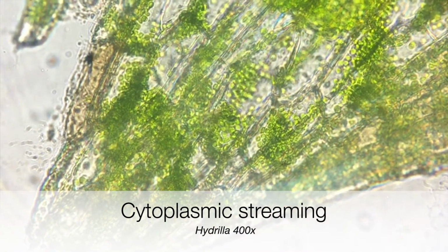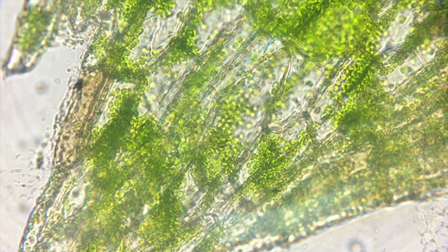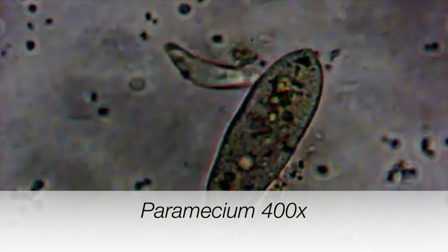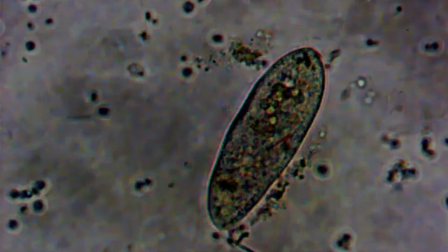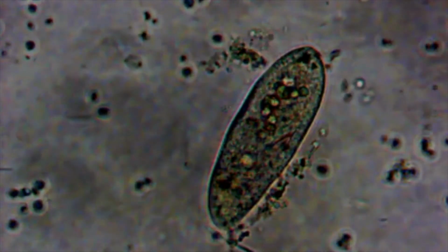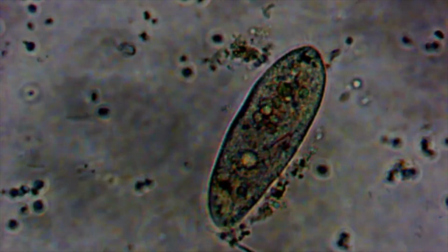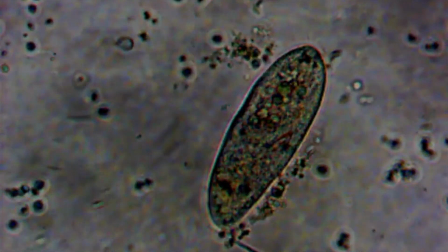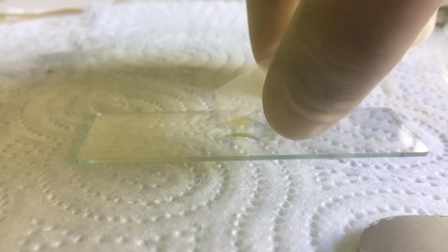Entire specimens can be examined under the light microscope, providing they are small enough to be mounted on a glass slide. They may be mounted in cavity slides or depression slides. All wet specimens for microscopic examination must be covered with a cover slip to protect the objective lens from water, oil, stains, and dirt.